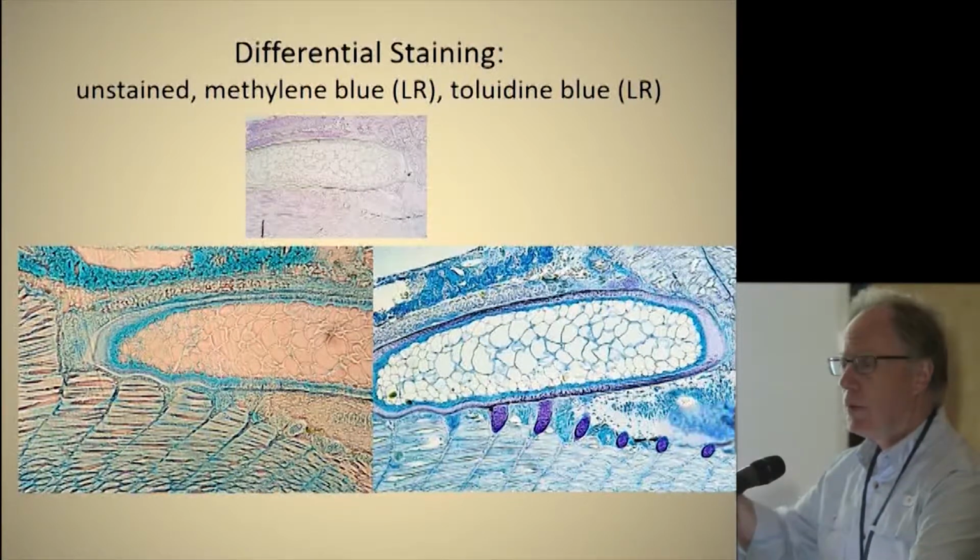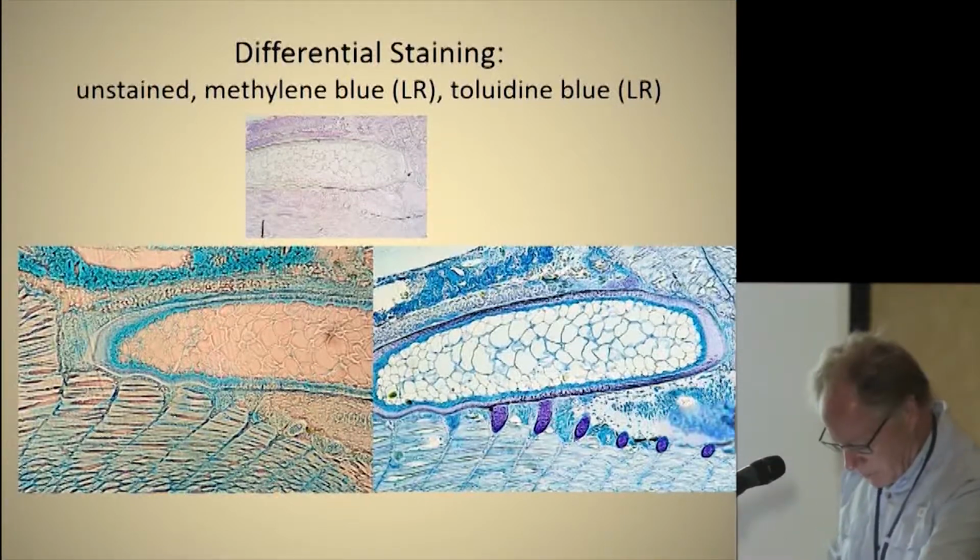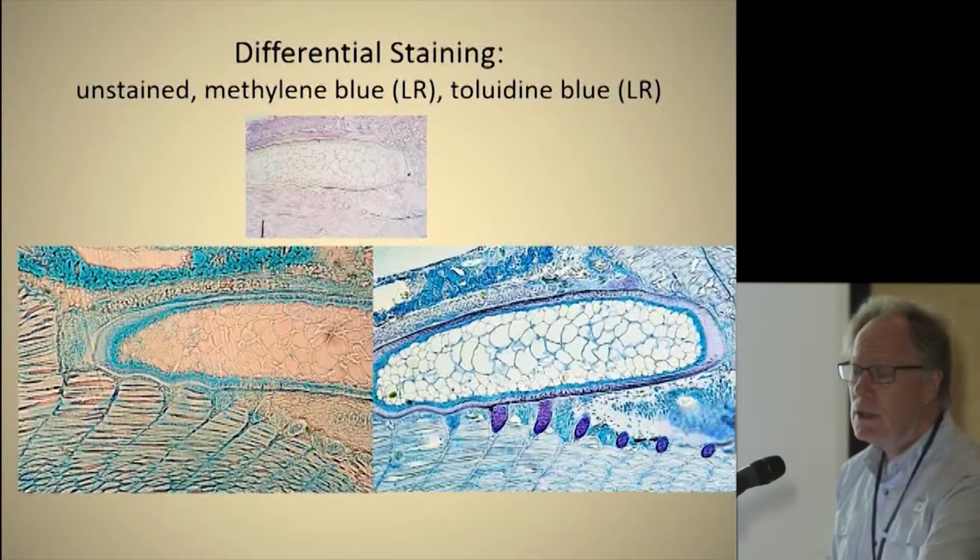Exact same fish, probably the same block. I'm sure it was the same block, maybe 3 or 4 sections deeper, just simply stained differently gives you a much better image, gives you more visual data.